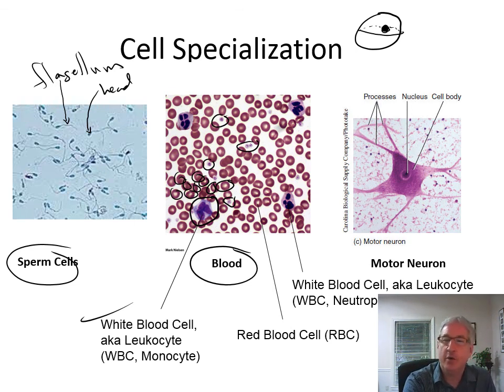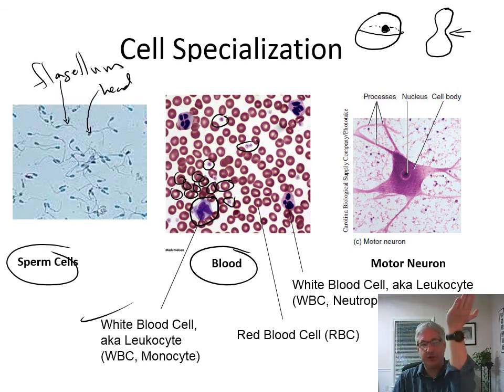So the cell becomes concave, and you have this narrowed part in the middle. When the cell is laying flat on a microscope slide with light going through it, it's thicker on the edges and thinner in the middle, so there's more light coming through the middle. That's why you have a lighter center and darker edges on the red blood cells, which makes it easy to identify red blood cells.